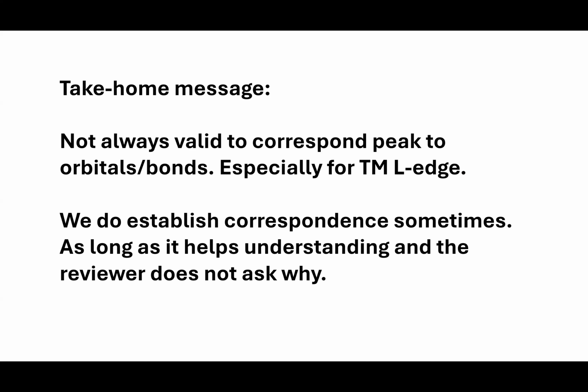But the complicated side is when the presence of the core hole cannot be ignored, and that's the case for transition metals.